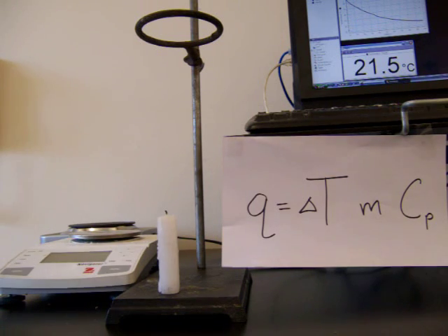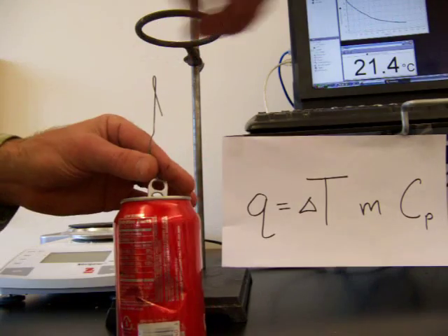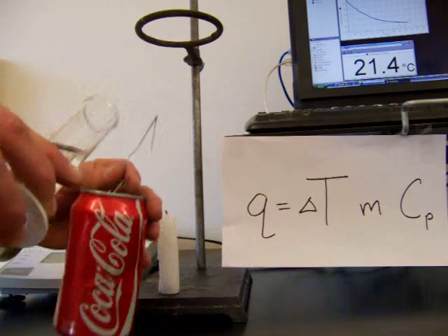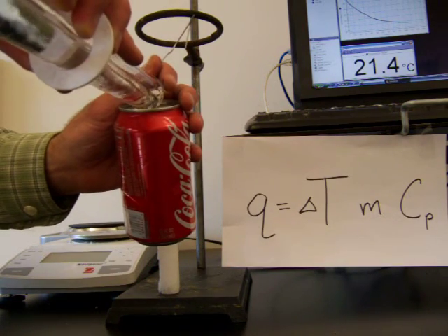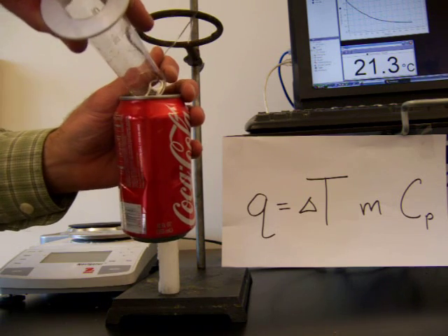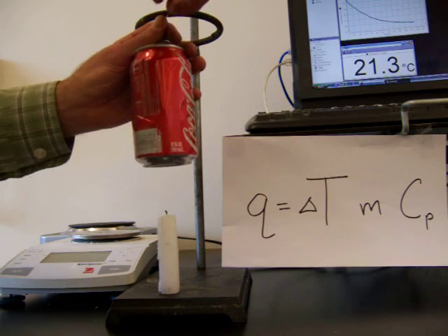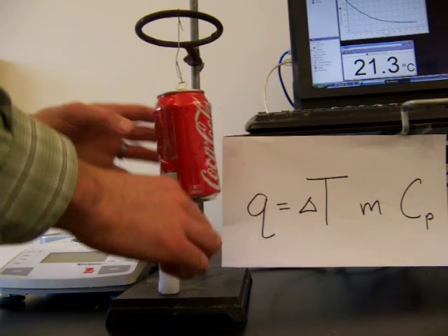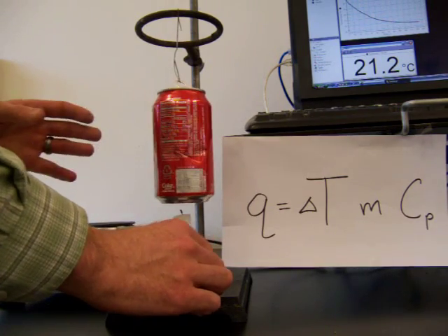The heat from the candle is going to go up and into a soda can filled with water. So we're going to have 100 grams of water, and this is room temperature water that I'm pouring into the soda can. So we have an aluminum soda can which is going to be suspended above the candle. And then as the candle burns, the heat that's released is going to go up and into the water in the soda can.